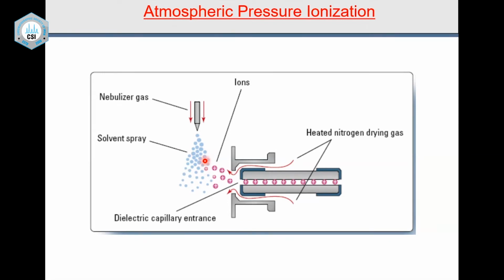So this is very important. This is a solution chemistry. There is no electron bombardment. This is what I said yesterday, that it is important to attend the GCMS session if you have to understand this better. There is no electron bombardment at all. There is no filament. There is nothing.